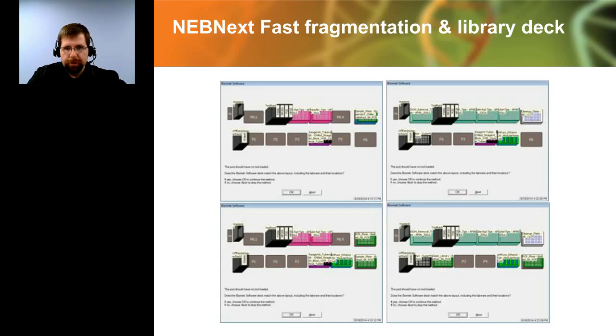The method has been written in such a way as to use partial plate transfers, and so if we're doing up to 48 samples, it will run, for example, one cleanup in columns 1 through 6, and then transfer column 1 to column 7 of the same plate, and then use columns 7 through 12 for the second cleanup. This allows the user to cut down on the amount of required labware. That makes for some pretty slick code.